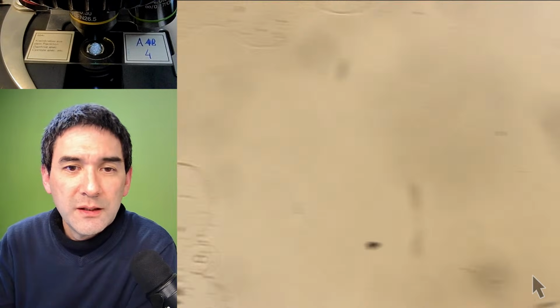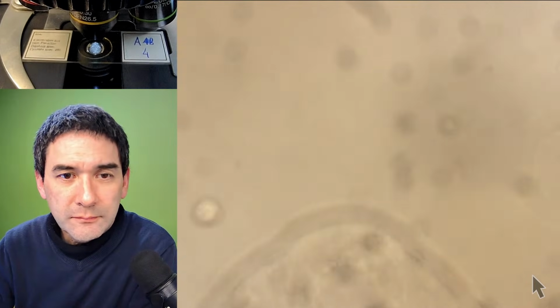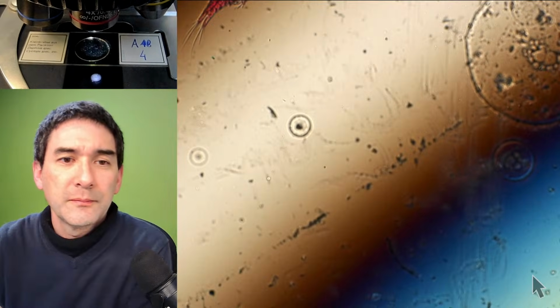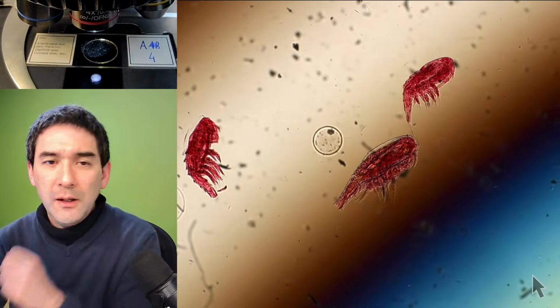And let's see if I'm able to find them. Dust and dirt all over the place. Okay, let's have a look. Where are they? You always want to start with the lowest magnification first. So, here they are.